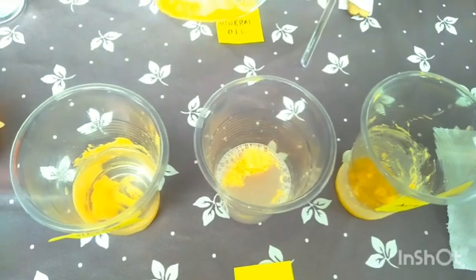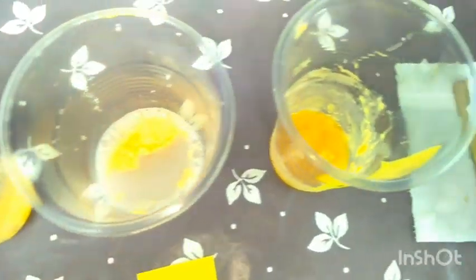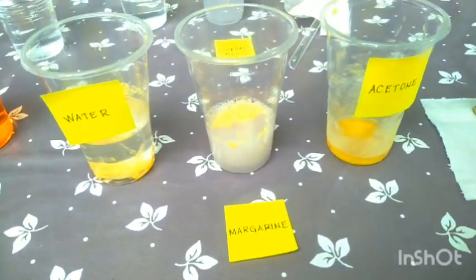As you can see, the margarine is quite different. It is insoluble in water, water with soap, and acetone.